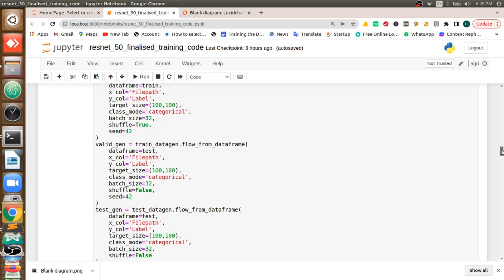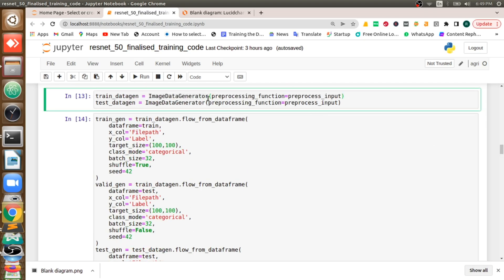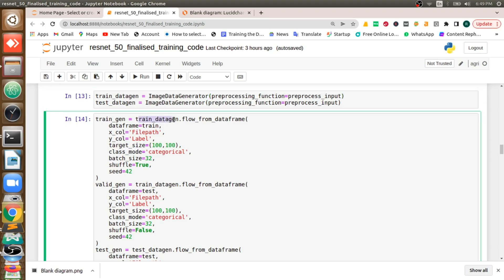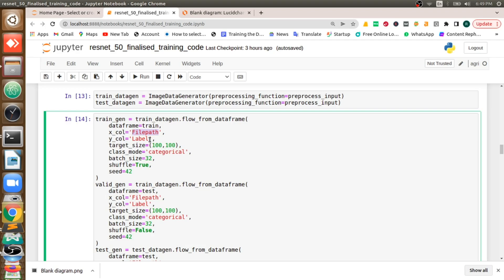Now as I mentioned, using data generator I should augment the data, then I need to create a batch of arrays, both input and output. So here what it will do is I will apply that, just defined here, so I will apply these data's file path, that is a file path and label which we defined above in dataframe.